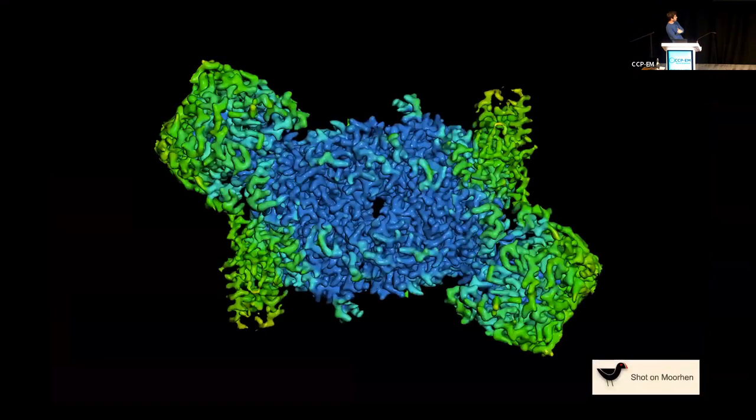And to sort of make the point, I have a few slides with a few pictures that I've taken on Moorhen. The first picture is a cryo-EM map. It's colored using the output of Occupy. So essentially, dark blue would be high occupancy, and then it goes all the way to yellow for low occupancy. But what I really want to show is that the picture right now is completely flat.